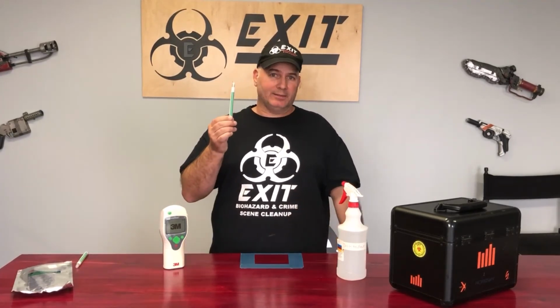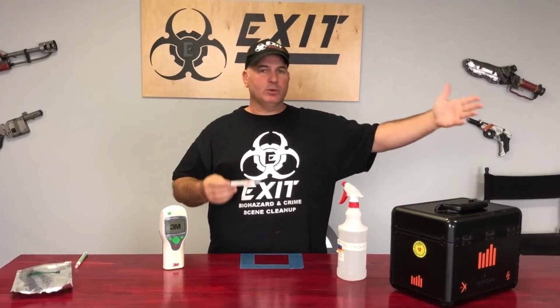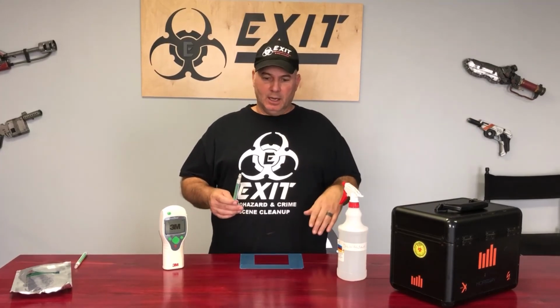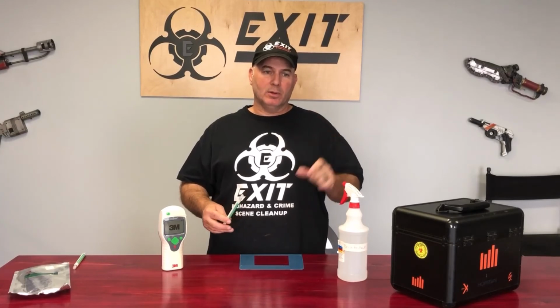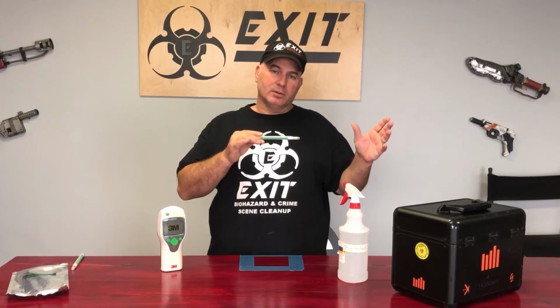And one of the things I didn't mention is that you're not just going to do one test, okay, in one little area if you're doing a whole area. Meaning if you're doing a factory or whatnot, you're going to take many tests and add them up and divide them, so you basically get the average of them so you can come up with that number. Okay, so some might be a little higher, some might be a little lower, but as long as your cumulative number is under what you set out to be or what they deem as clean, you're good. If it's higher, then you got to do a better job.